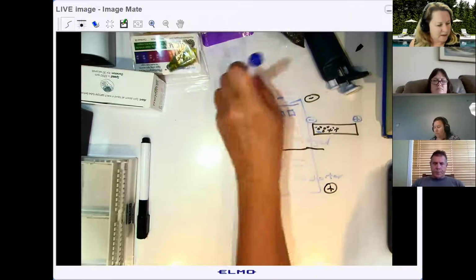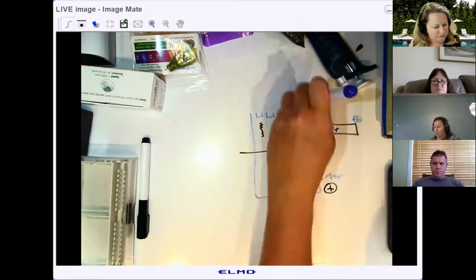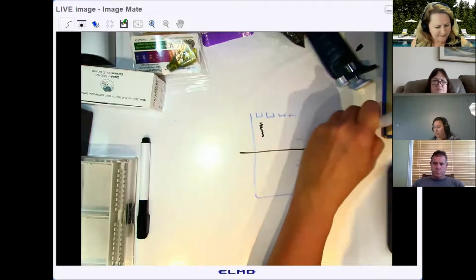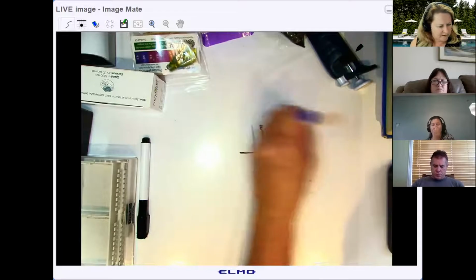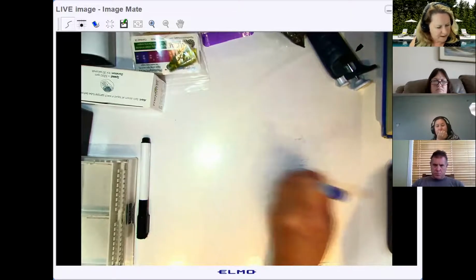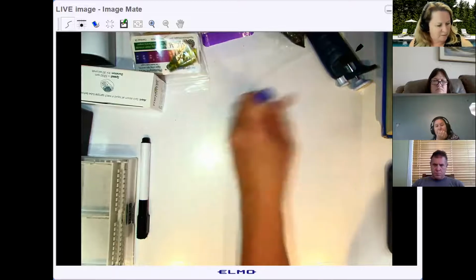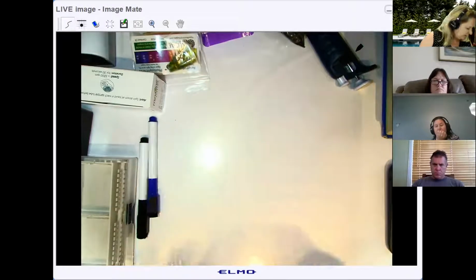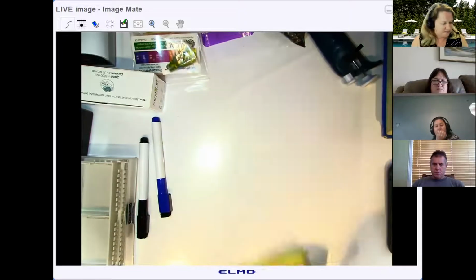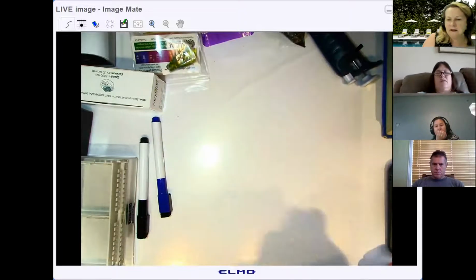Okay. Now, there's lots of different gel boxes you can use to do this lab. And this lab is probably, if not the most expensive lab to run, one of the most expensive, because the equipment to do it with a class of 30 can run into the thousands of dollars. But there's a couple different ways to do that if you don't have the equipment.